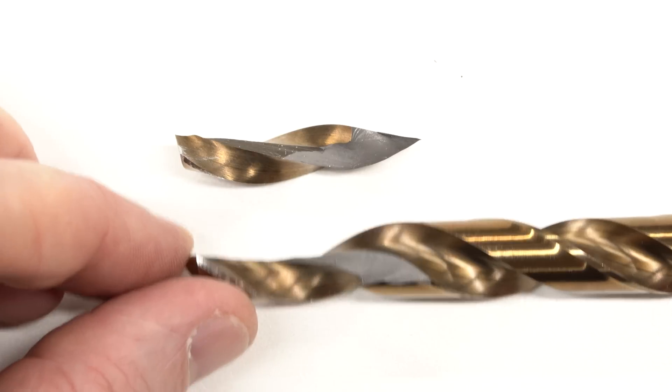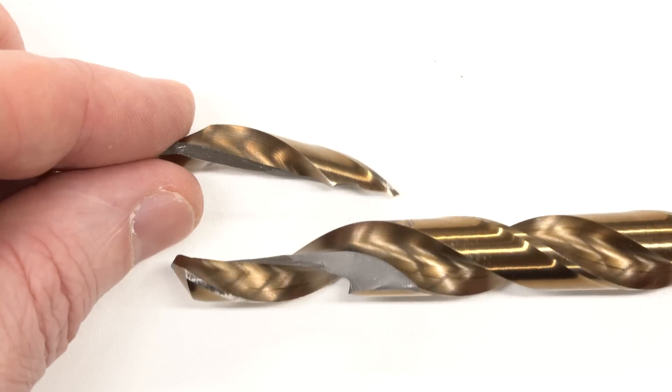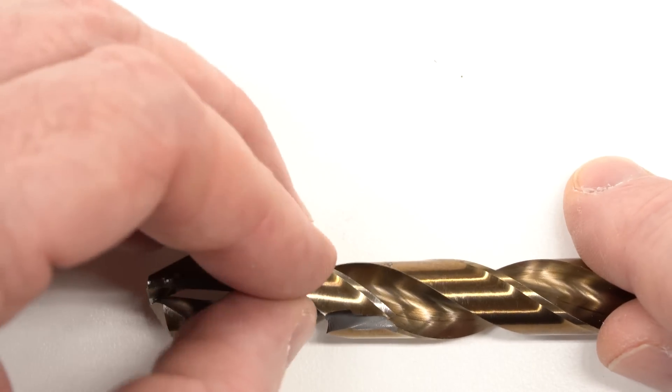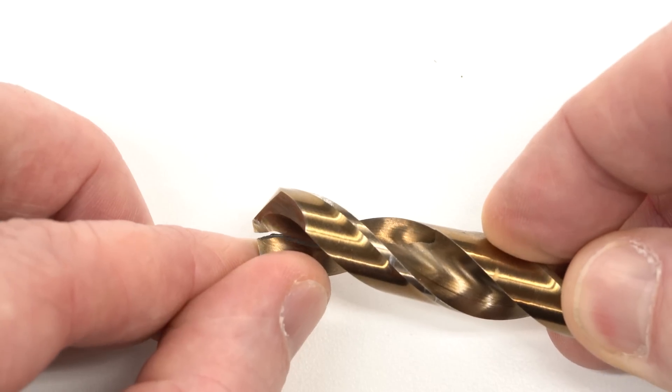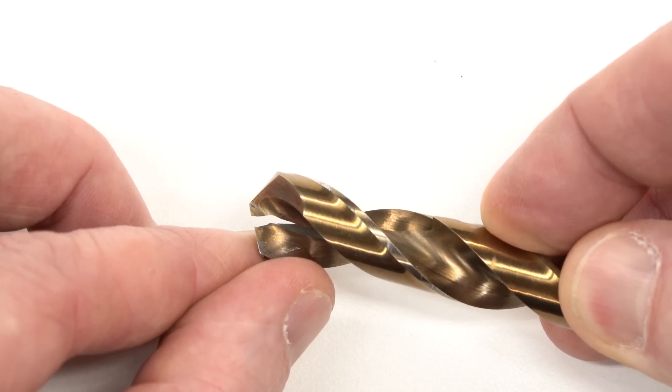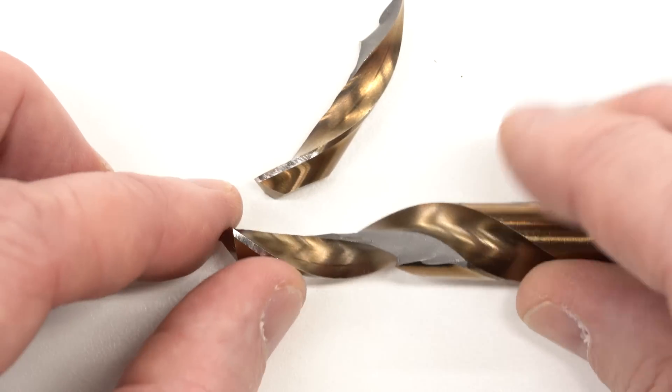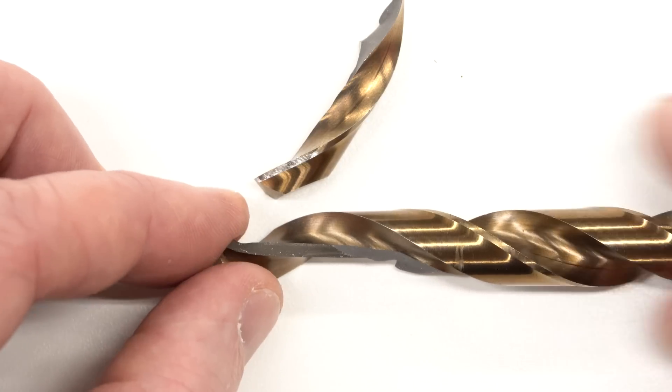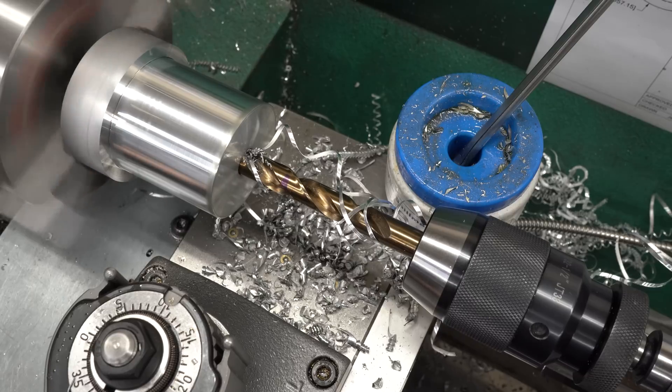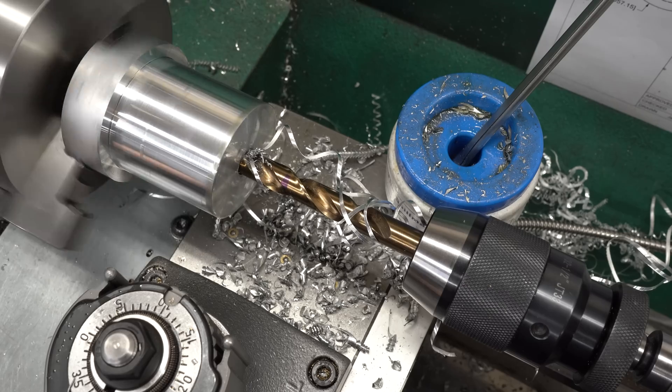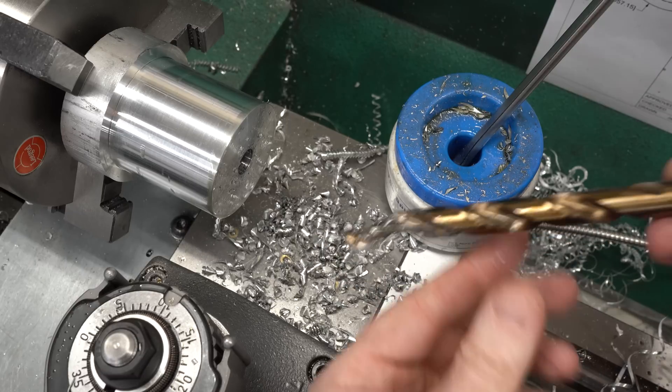This is the drill in question. This is an M42 cobalt drill from Drill Hog. This is actually a split point grind. The first thing I noticed when I look closely at this is that it's broken. But aside from that, it just broke into two pieces. I've had drills shatter before and usually you get a whole bunch of pieces, this just split right down the center. But not starting at the split point where I would have expected it to be the weakest, it split a little bit off center from that. This all happened in the lathe while I was drilling in aluminum. I was enlarging a pre-drilled hole and the drill suddenly just jammed and spun the chuck. When I finally got it wrenched back out of the workpiece it was broken just like you see it here.